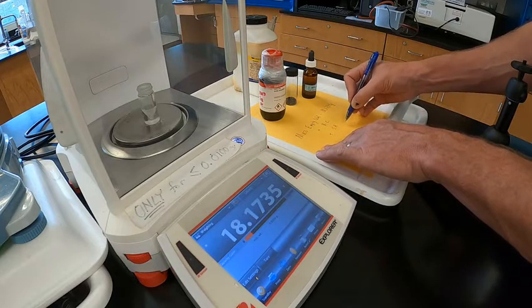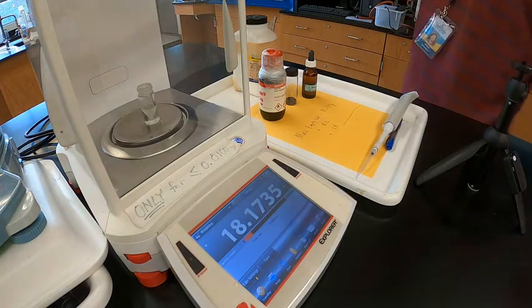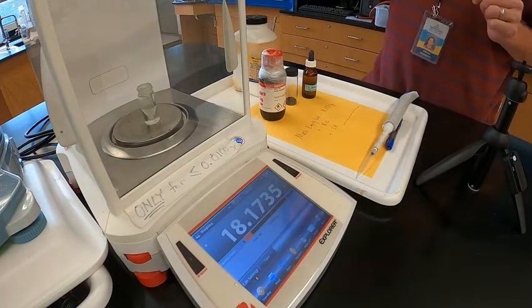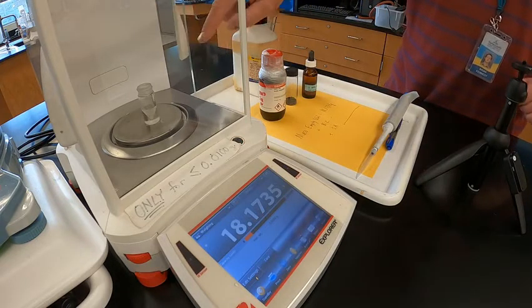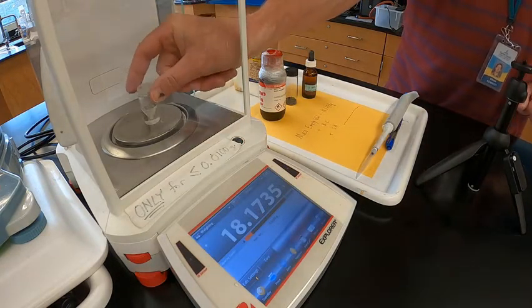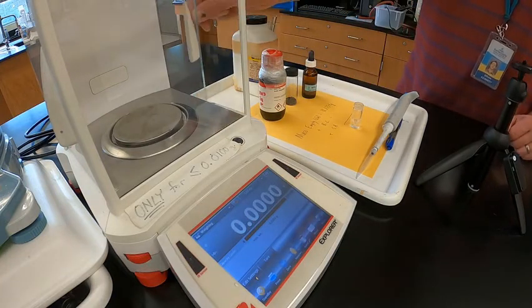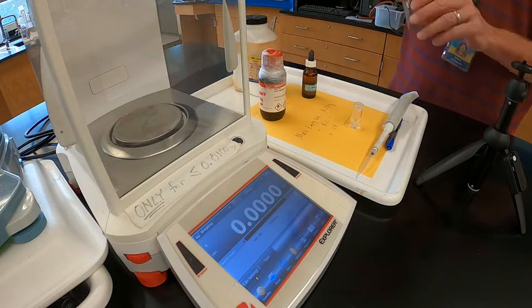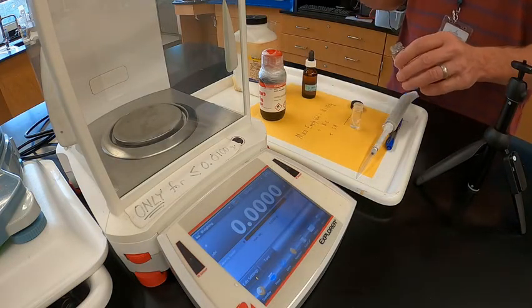We need the mass of all three of those things, so you can do the math, subtract out, and obtain the mass of the reactant salicylic acid. When I have people mass things in the lab, a key thing is to take the vial out of the balance and then add the necessary reactants.